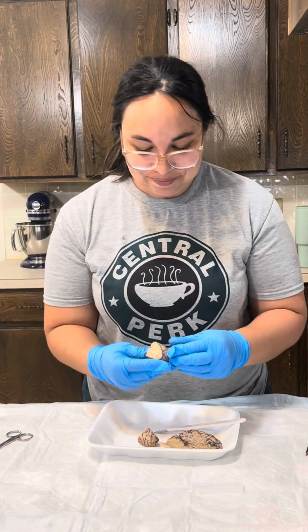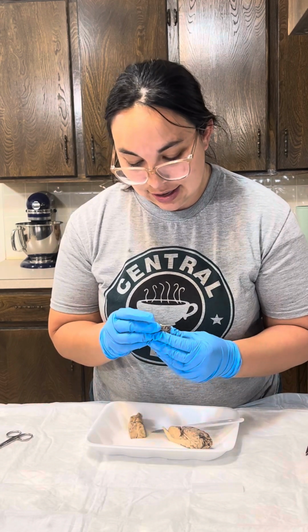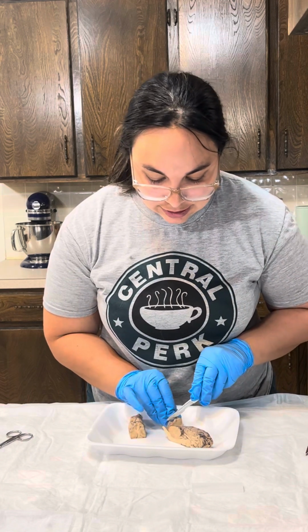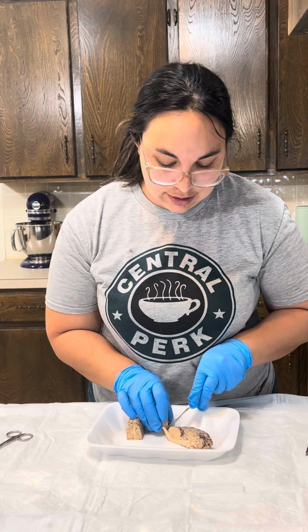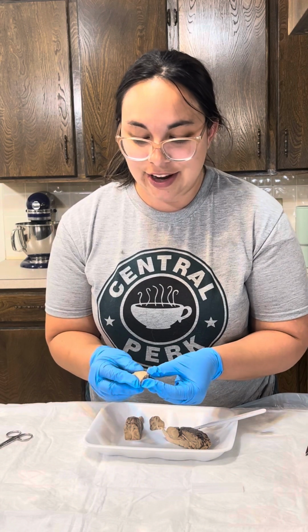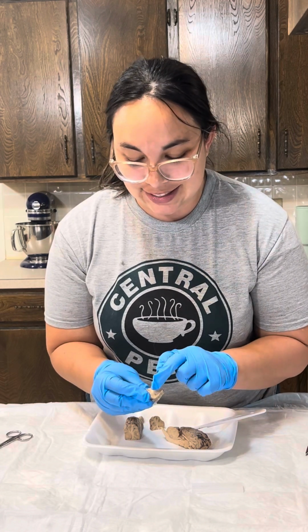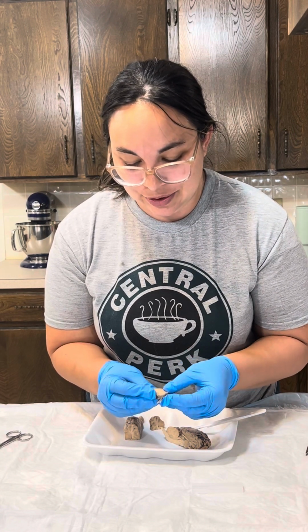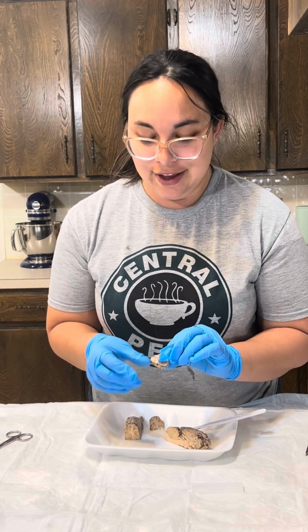When we're looking at this, we're looking for the hippocampus, and it's in here. Let's see. Maybe it's easier. Are you going to close your eyes again? You're okay. It's really funny, they call it a jelly roll to look for it. So the hippocampus is in here. You can see that little roll right there, and that's what's used for the emotional state and memory processing. So that's what that is.